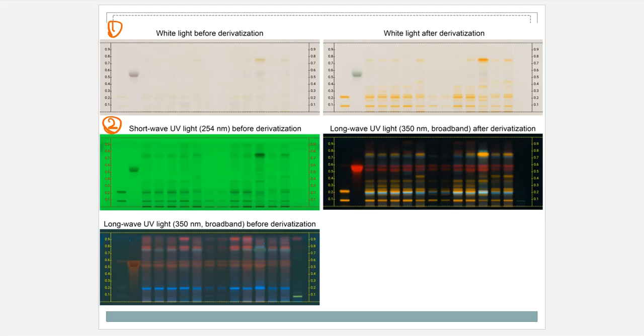So that is going to make my job way easier versus the white light that I'm just going to be seeing with my own eyeballs, and that is it. I see way more detail. I see extremely more number of bands. And I can take a picture, and I can take my time, and I can calculate RFs due to those positions.